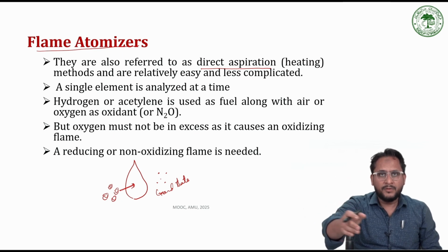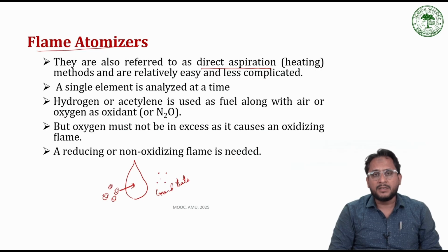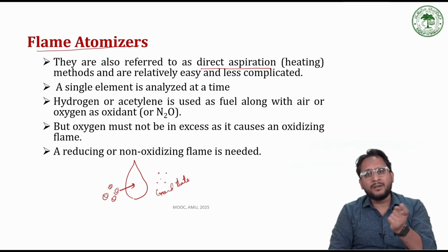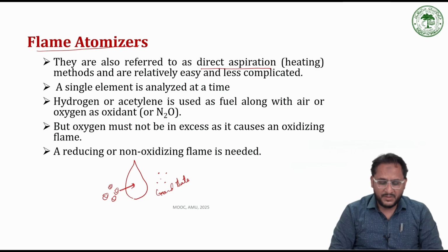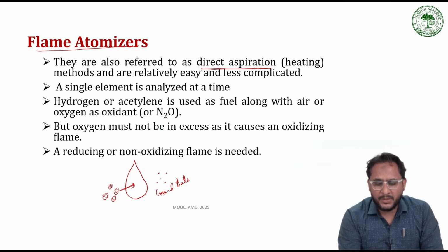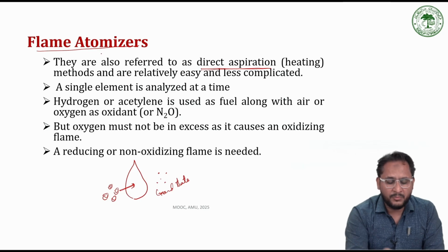We do not excite them with the help of heat. They should be excited by absorbing light, not by heat. So we have to keep this in mind. So this is the direct aspiration technique, also known as flame atomization. Here we analyze a single element at a time.